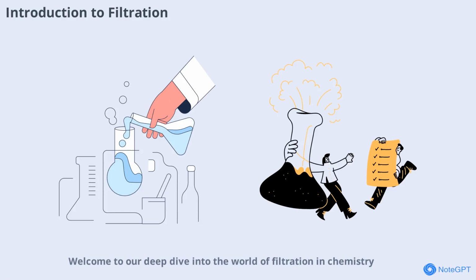Welcome to our deep dive into the world of filtration in chemistry. Filtration is a fundamental separation technique used in laboratories and industries alike. It allows chemists to separate solids from liquids or gases using a barrier, typically called a filter. This process is crucial for purifying substances, isolating products, and ensuring accurate experimental results. In this video, we'll explore how filtration works, its various types, and real-world applications.